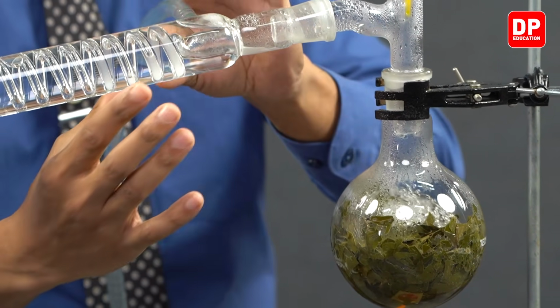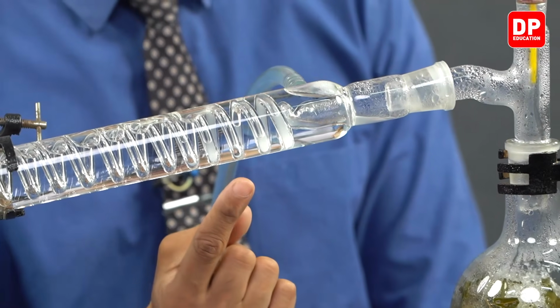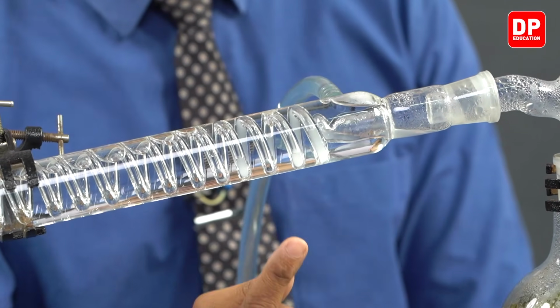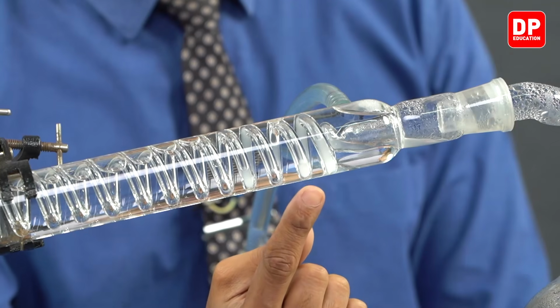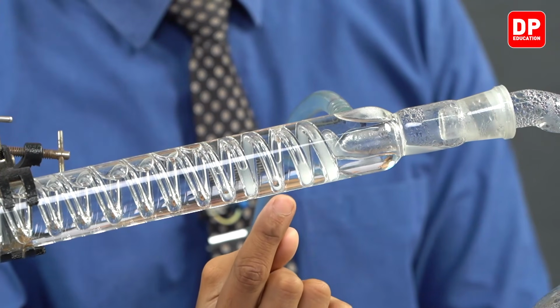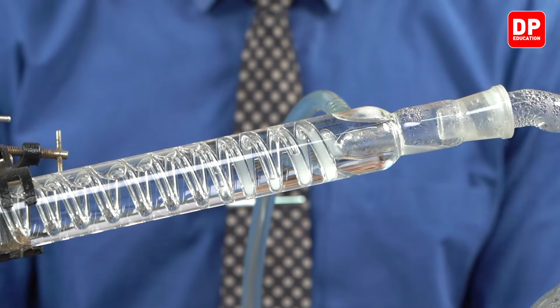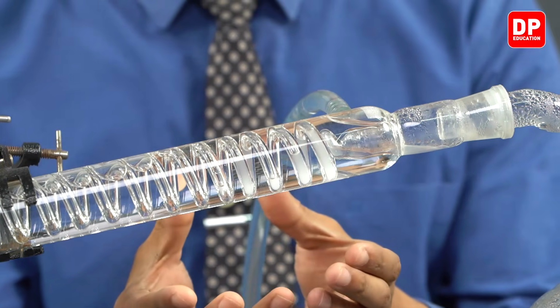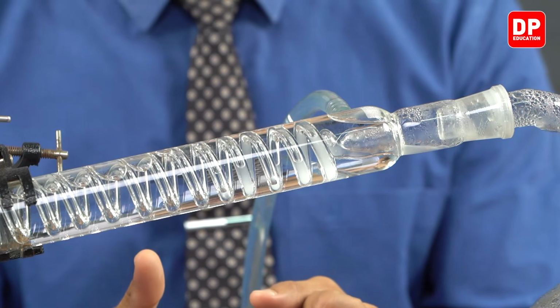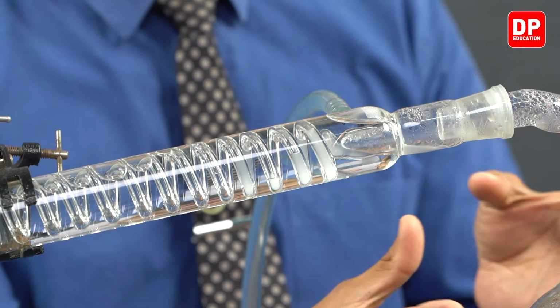And when it is directed over here, you can see that they have condensed into a liquid. You can see that there is a translucent liquid inside this condenser. That liquid is present there due to the condensing of the vapor that was produced here.